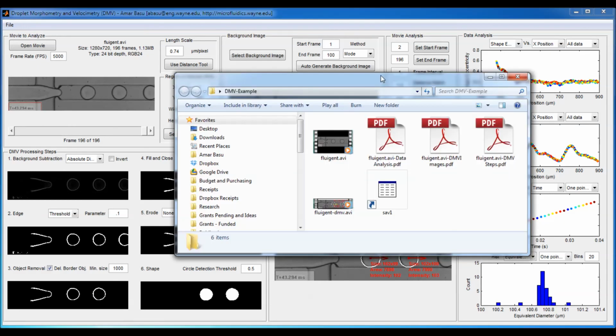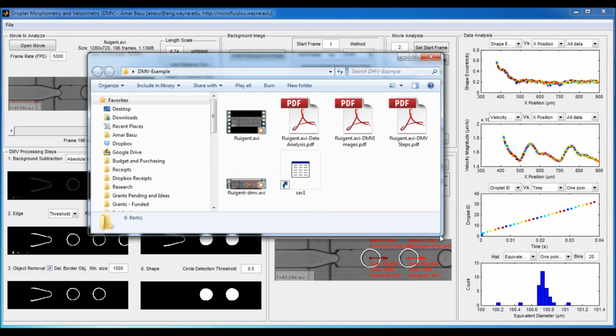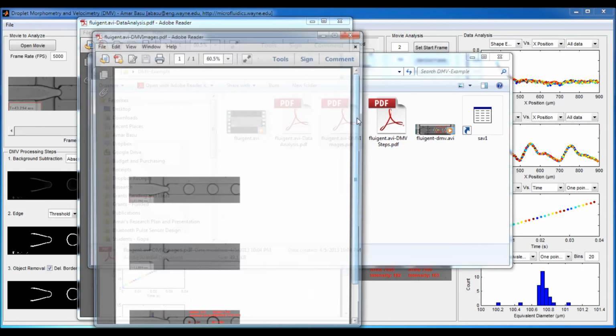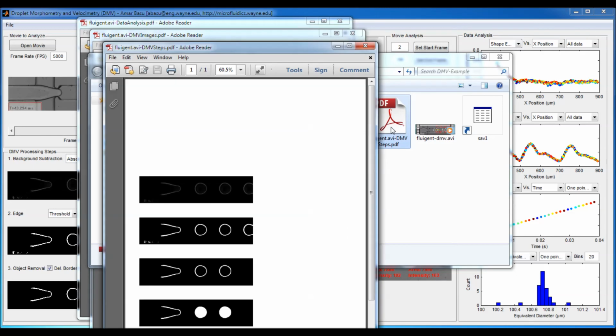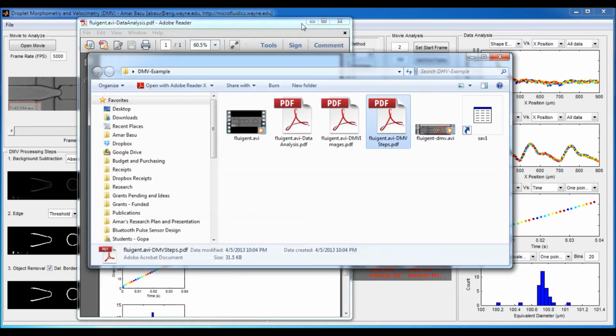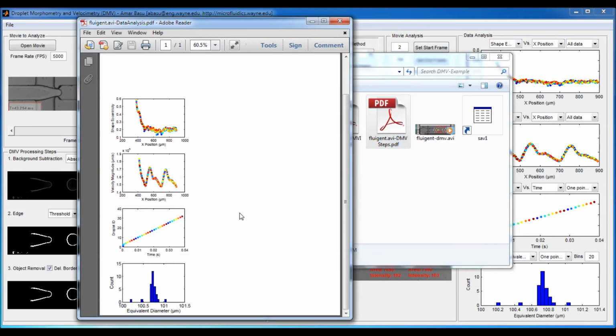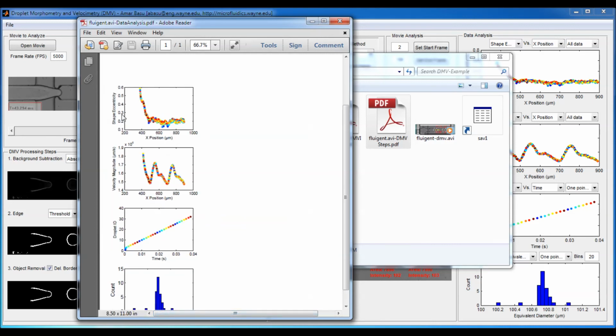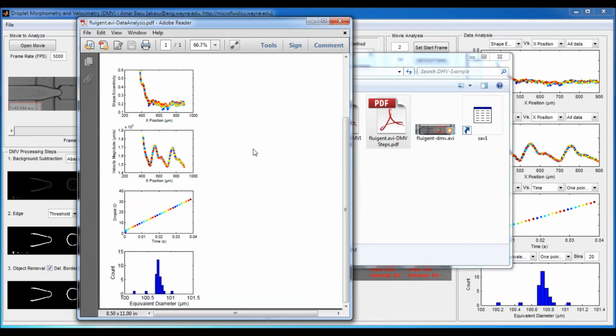and if we look at our current working directory, we'll see that there are 3 PDF files in there which have the same data. You can see the image files here. Okay, and the PDFs were made so that the width of each of these figures is somewhere between 2.5 inches, something like this. So it's made to be put in the column of a journal manuscript, and that's how we did it in our lab on a chip paper, in fact.